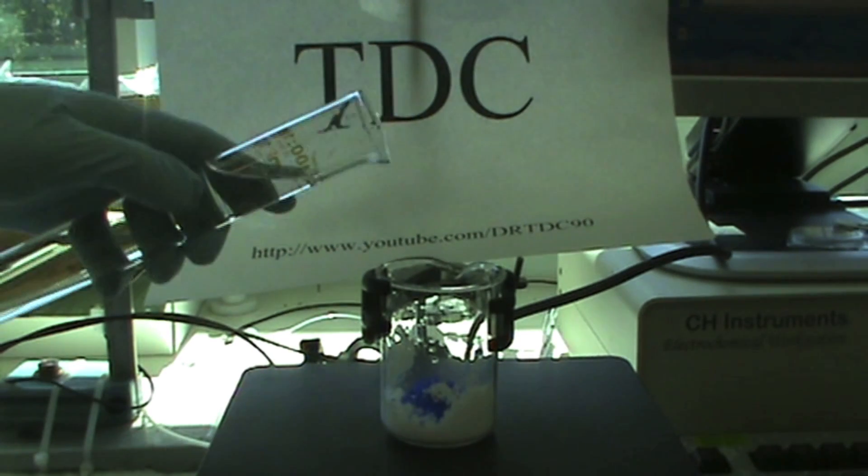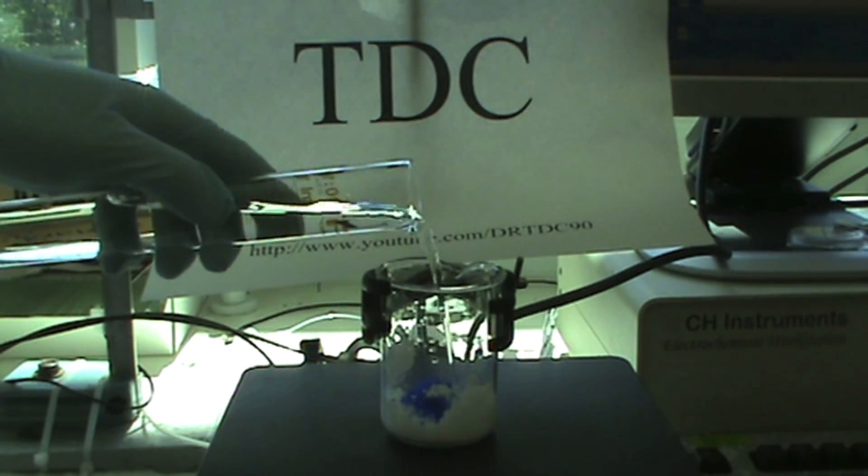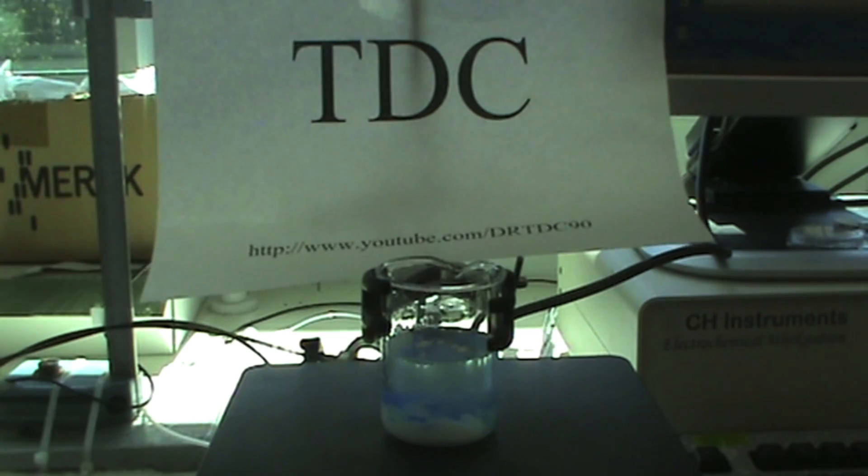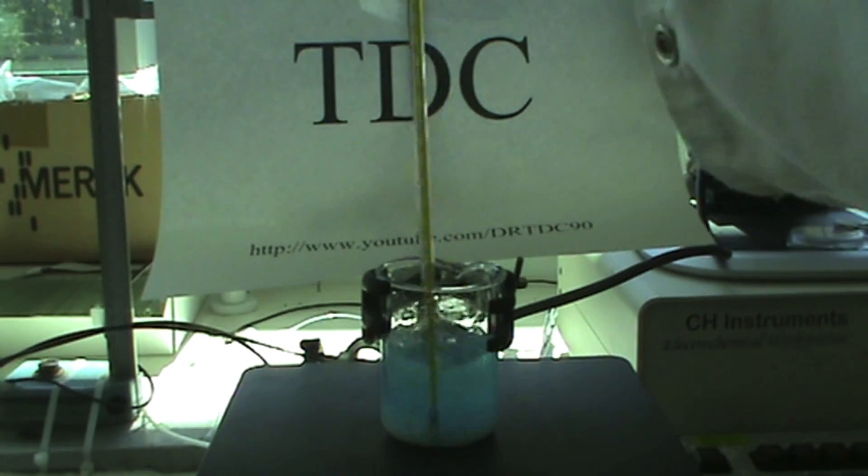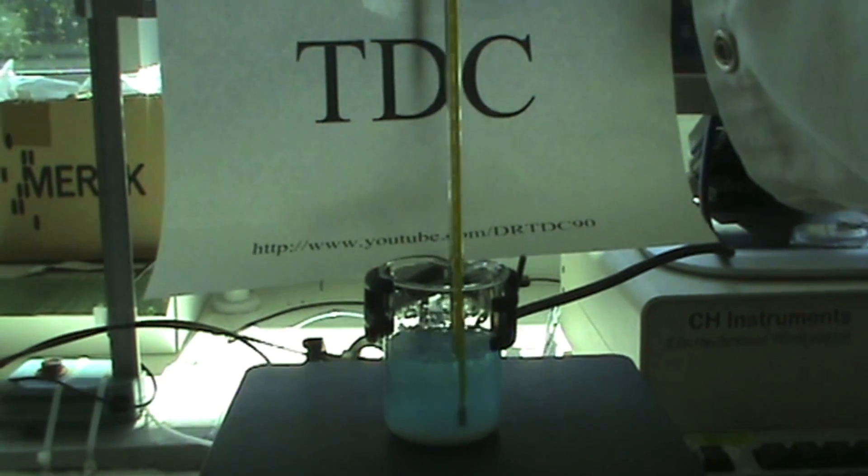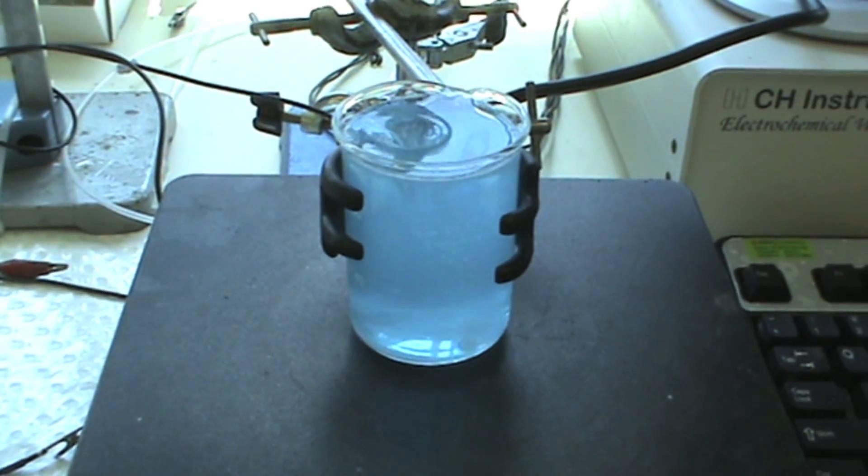To the mixture, add about 50ml of millicule water and stir. Next, turn the hot plate on. Note, it will take a while for the chemicals to dissolve, so add another 50ml of millicule water and a stir bar in the beaker.